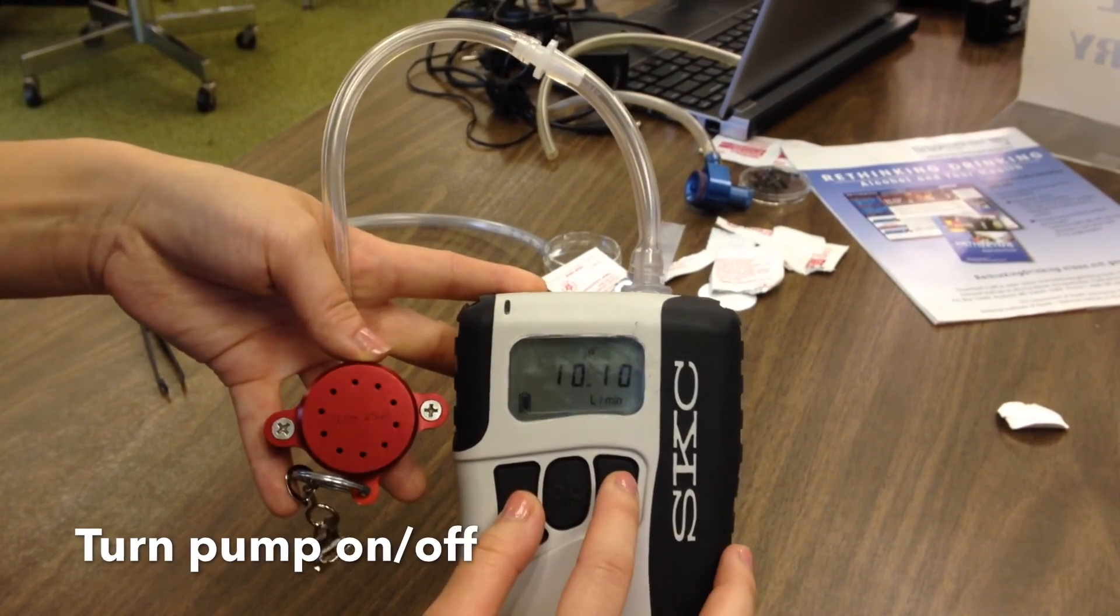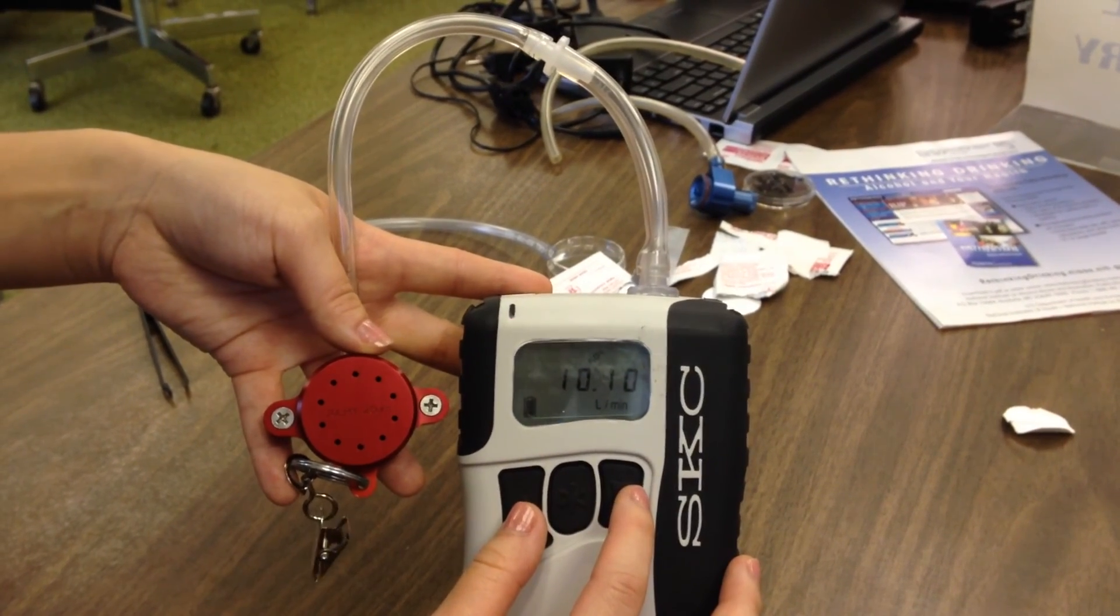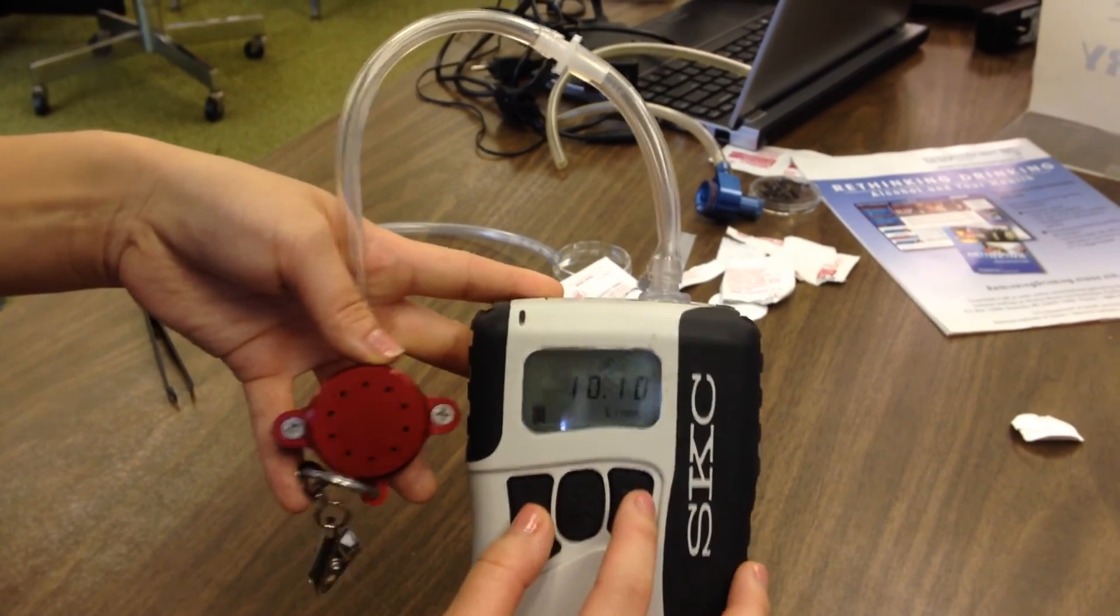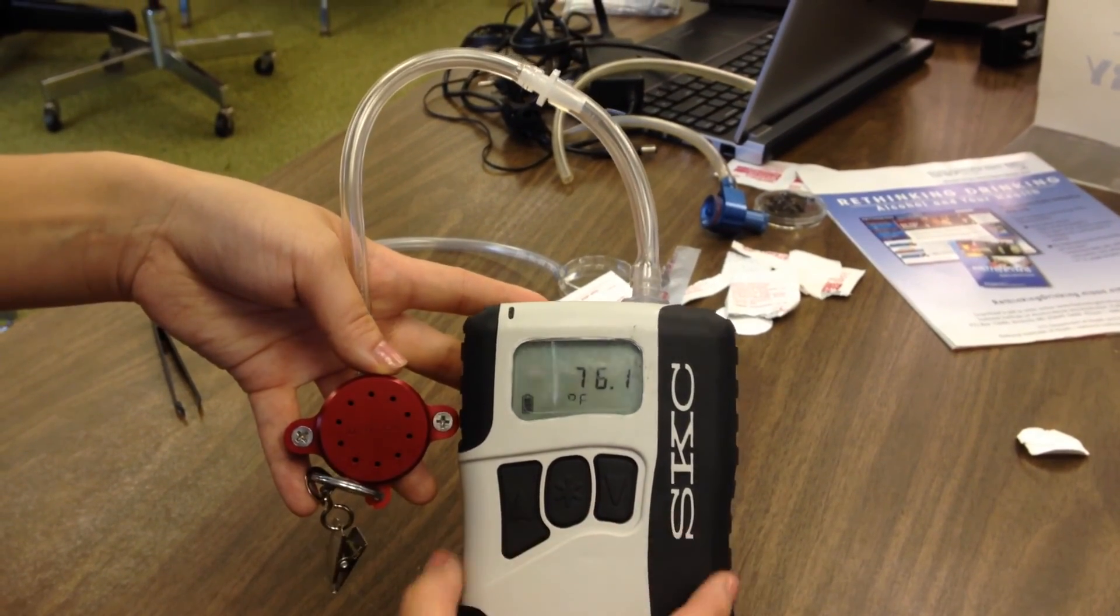Press both up and down arrows simultaneously to turn the pump on and again to place on hold. From hold, press the middle button to turn the pump off.